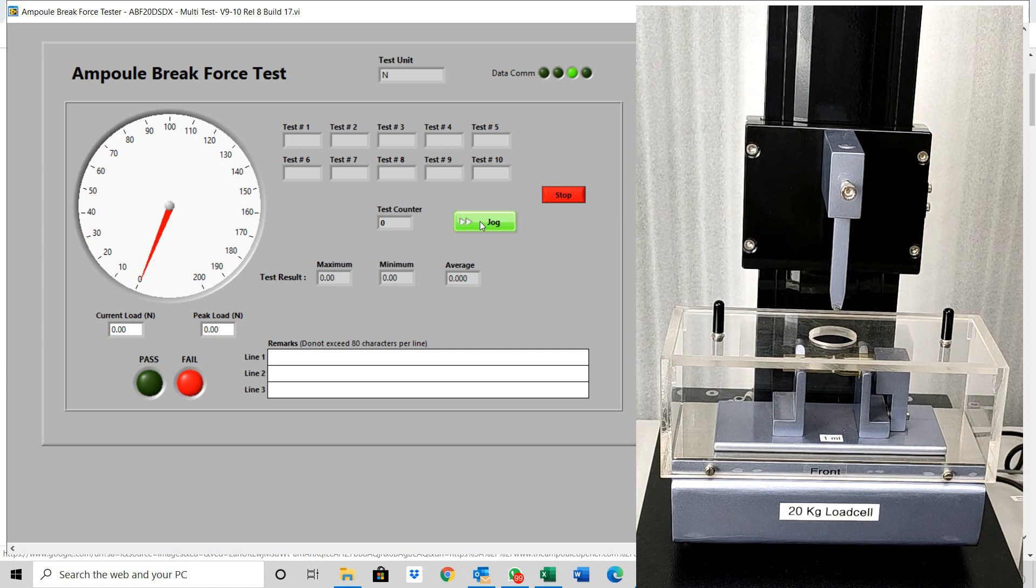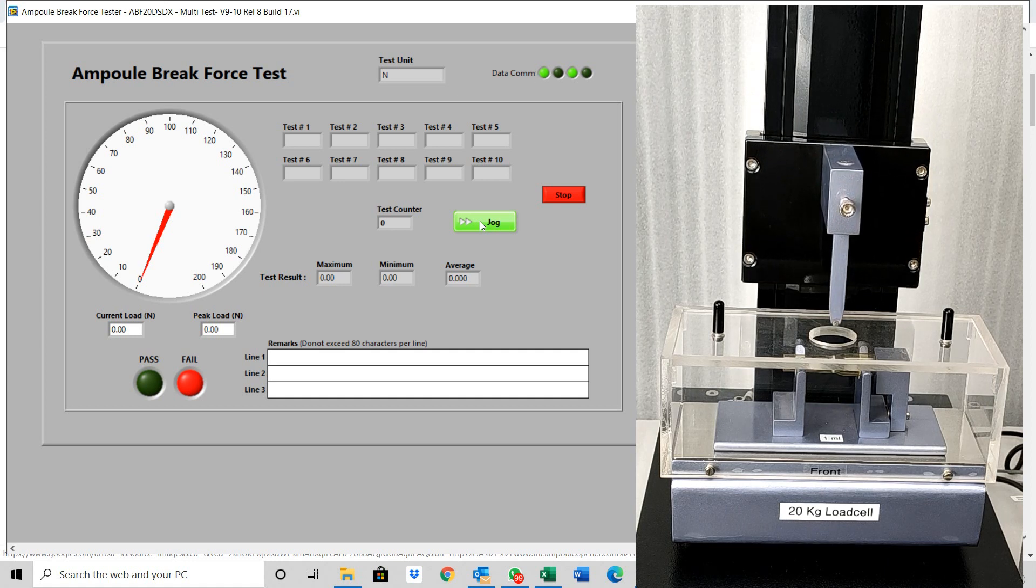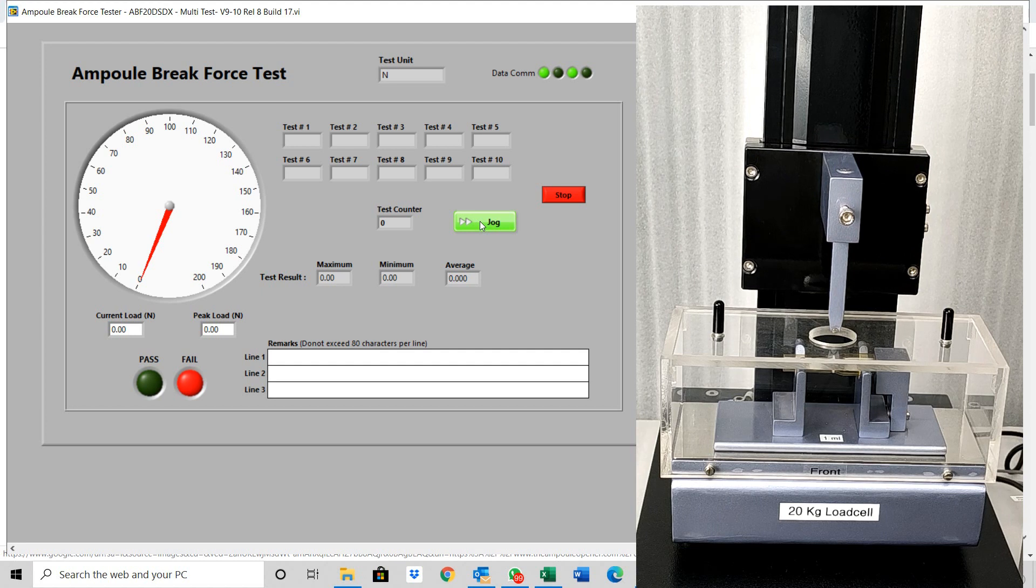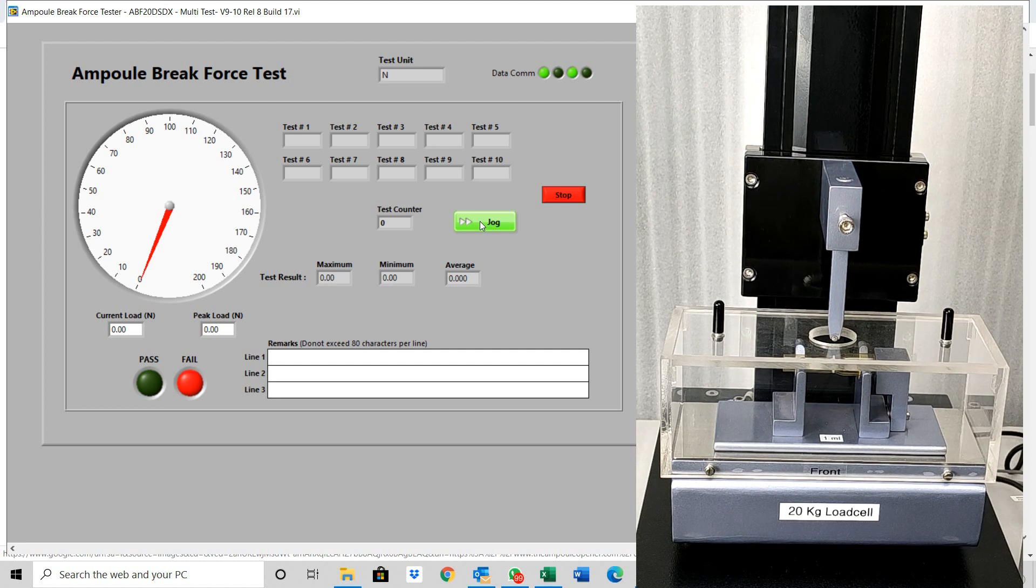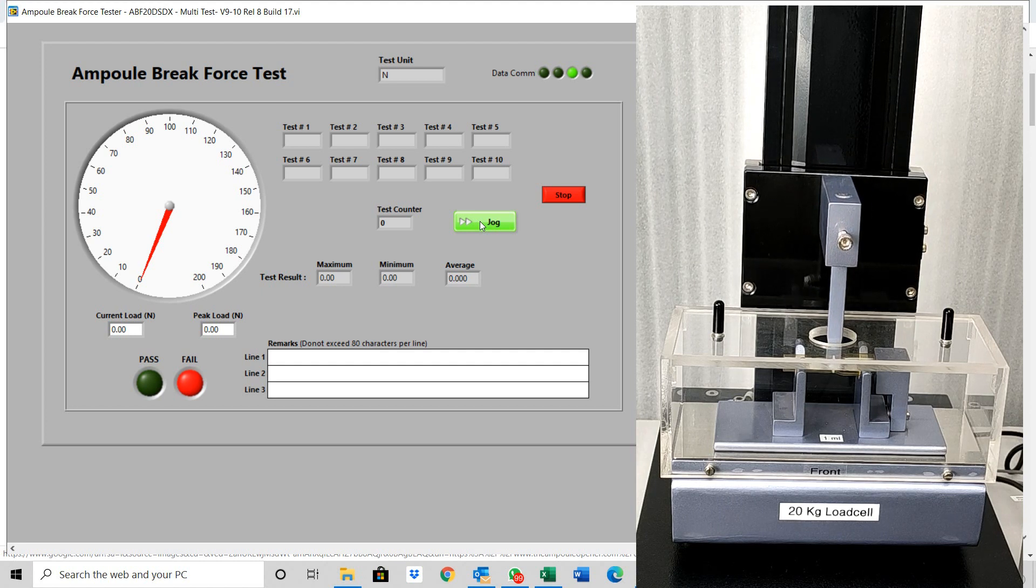When the wedge comes very close to the sample, press jog again to make the machine move at slow speed.